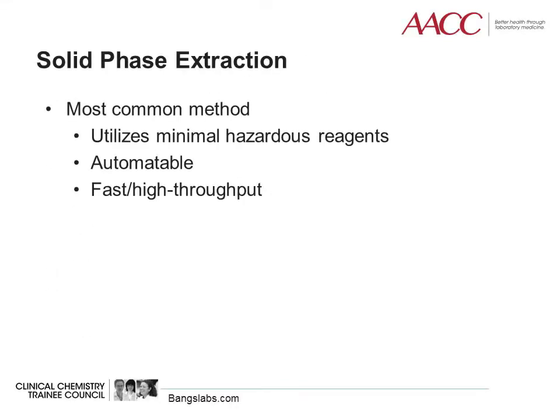Most extraction procedures used today are solid phase methods, in which the nucleic acid selectively binds to a surface or a bead under one condition and comes off after being washed in another condition. Solid phase extraction methods are advantageous because they utilize minimal hazardous reagents, require fewer and easier manipulations, are automatable, and can be utilized for high throughput needs. The three major types of solid phase extraction will be discussed in the next slides.